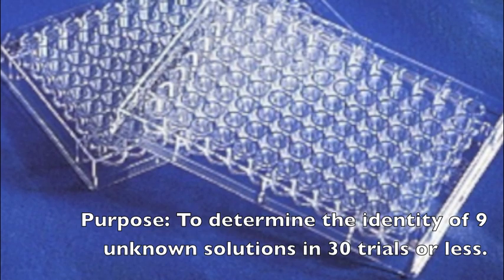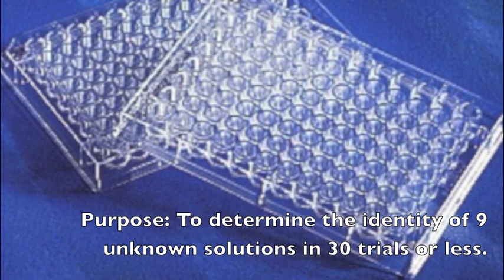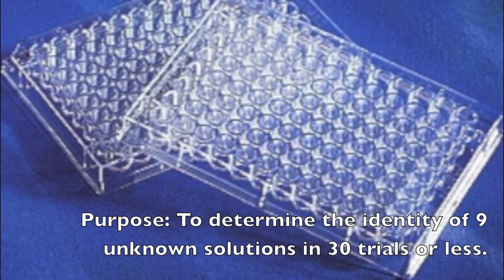A column for each of the 9 solutions will be made in the microplate. Be sure to pay close attention to each location of the solutions. Then, one at a time, each solution will be mixed with each of the others and observed for a reaction or formation of a precipitate.